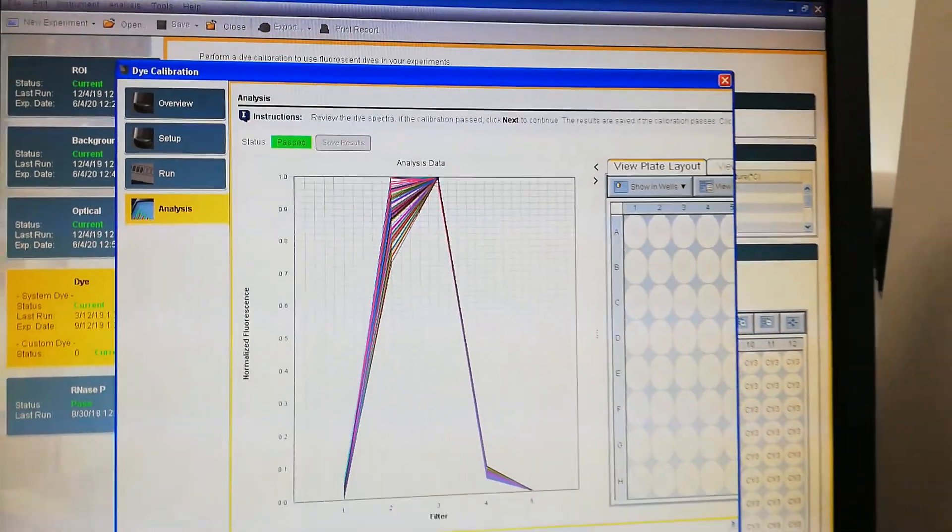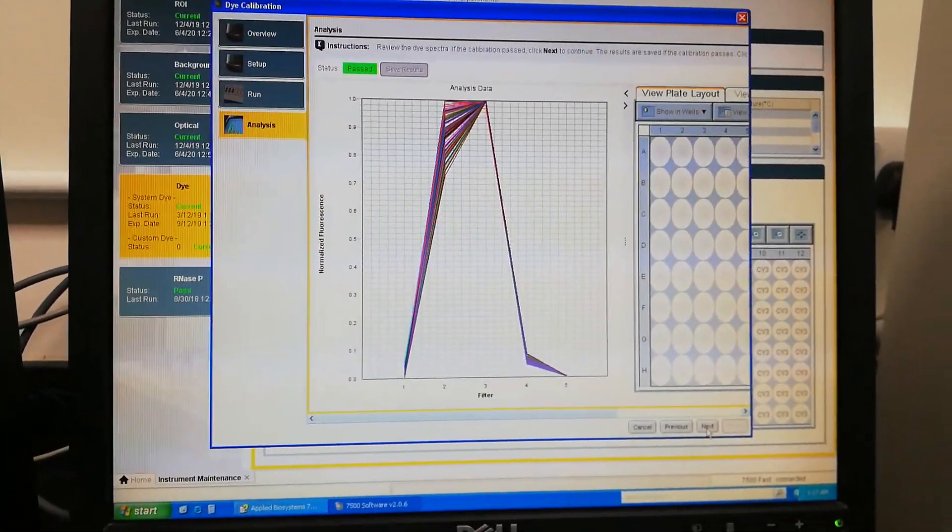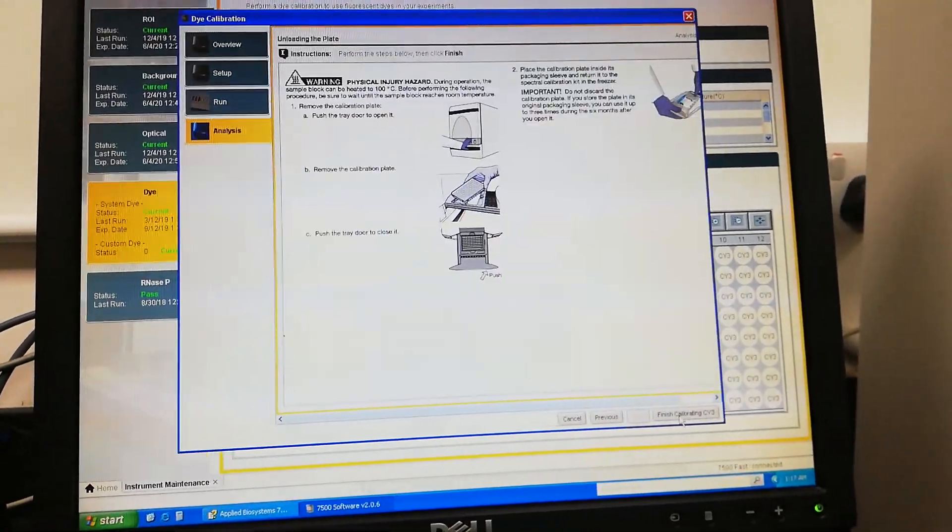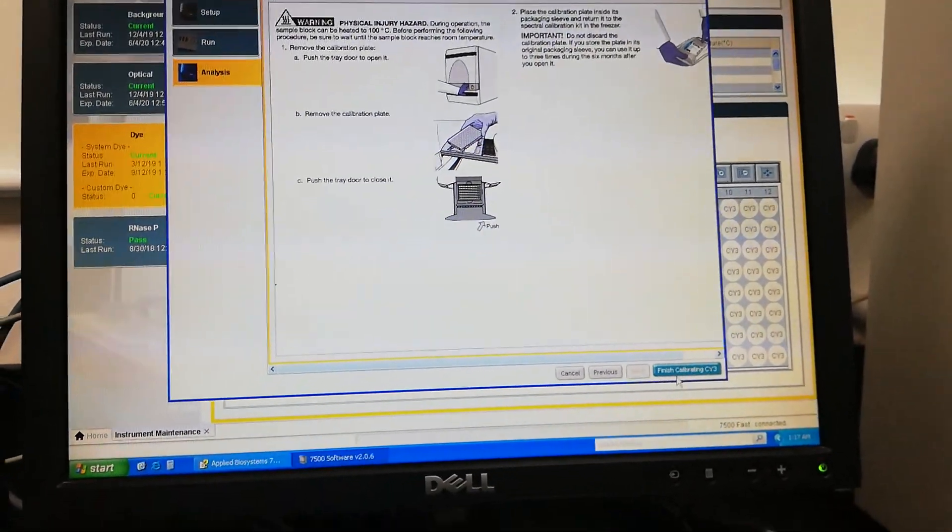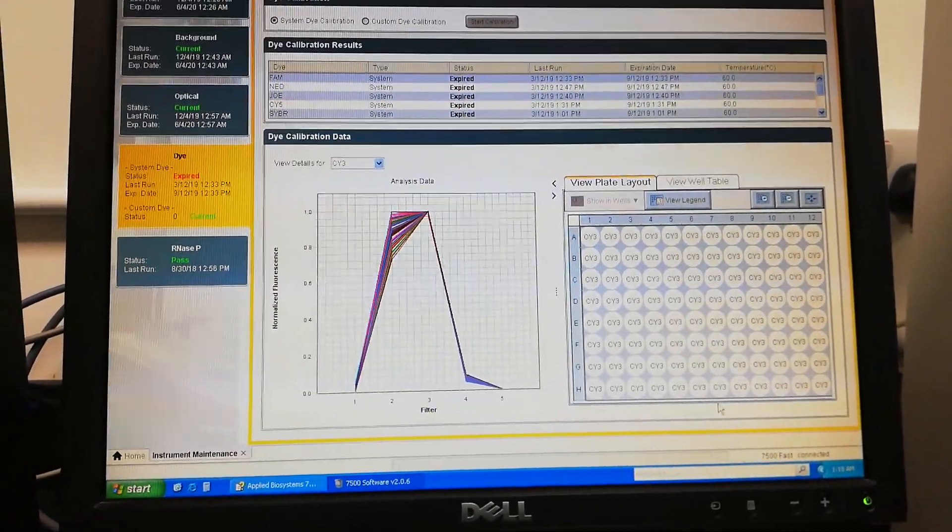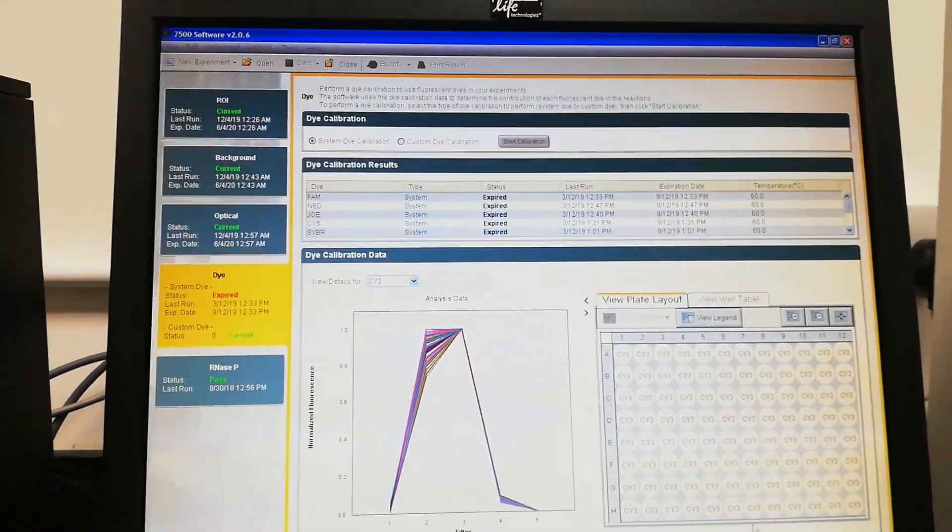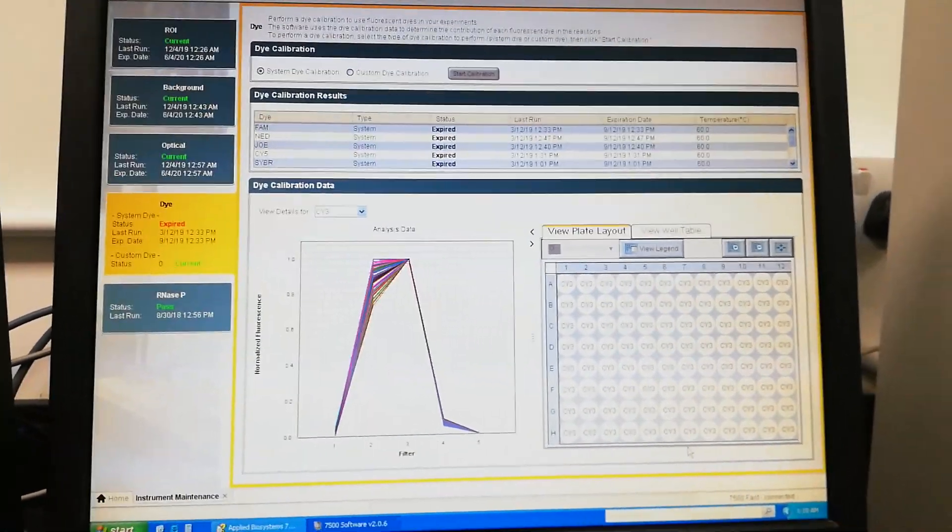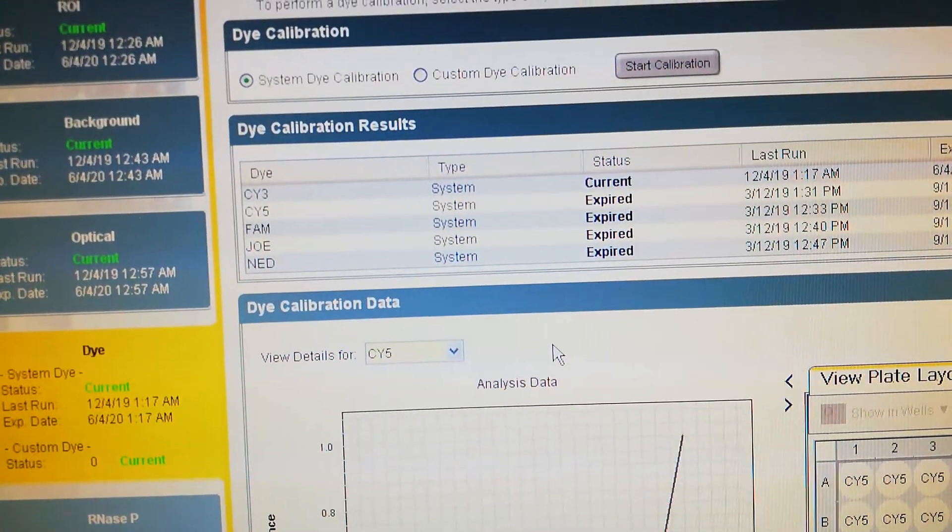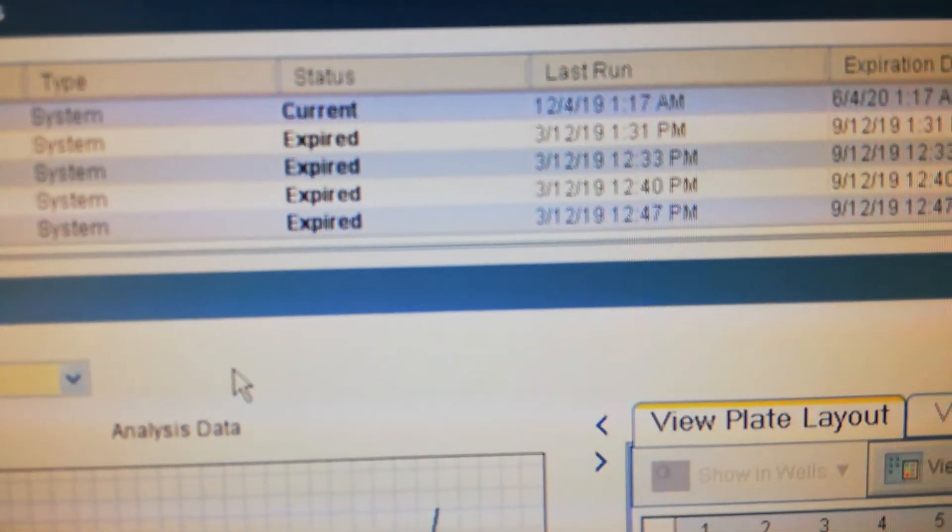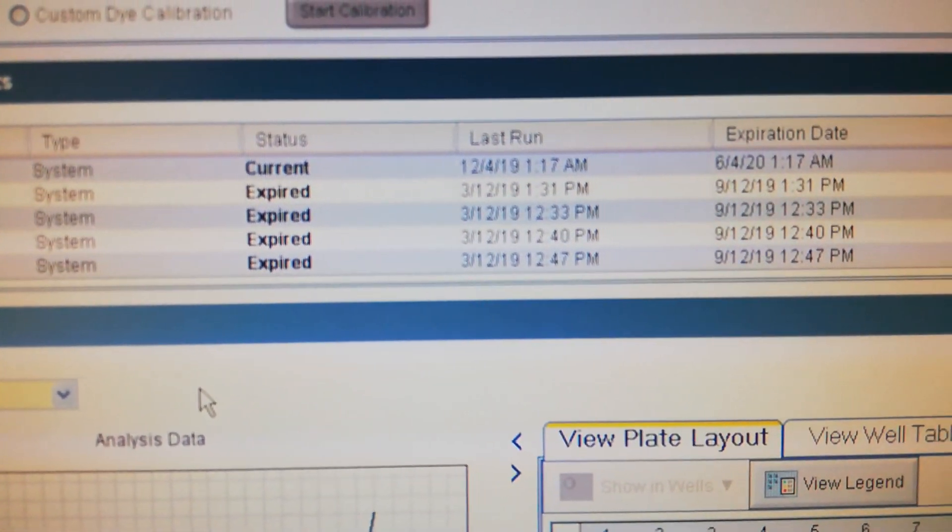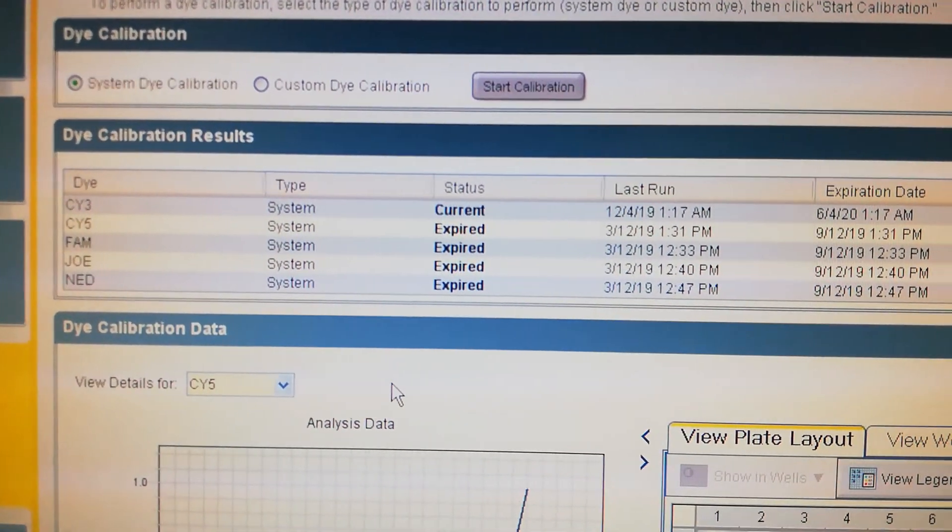We can just select various dyes and do calibration for different dyes. Finish calibrating CY3, and it is done. Here it is showing the status. CY3, you can see that today on 4th December we have just calibrated the system for CY3 dye.